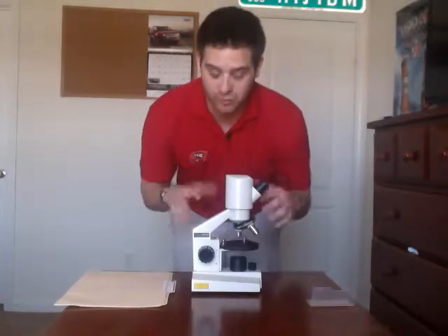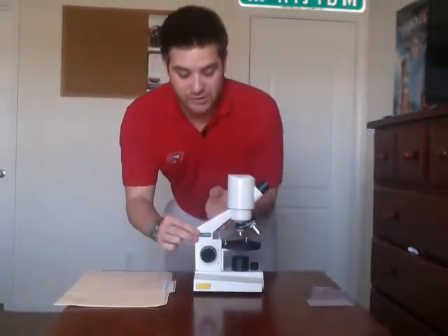Now, there are some safety guidelines and procedures that you need to follow when working with these. You want to make sure that you always carry the microscope by the arm, which is this piece right here. When you're carrying and moving it, you want to always have one hand on the arm and the other one placed at the bottom underneath. And when you're walking with it, make sure that it's at least chest high, so that if it's too low, you may bump into a table and damage it or drop it. And these are really expensive, so that would not be good. I don't want that to happen to you.